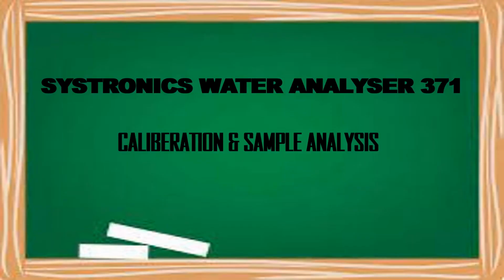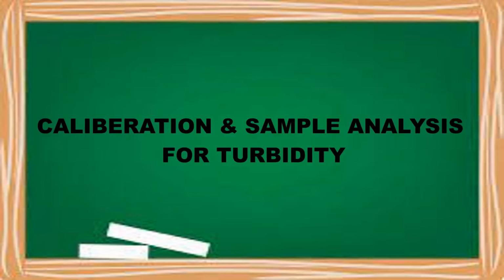Good morning, dear students. Today we are going to see the calibration and the method of sample analysis using Systronics water analyzer 371. First we are going to see the calibration and sample analysis method for turbidity.